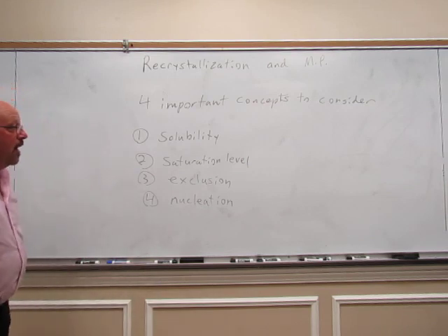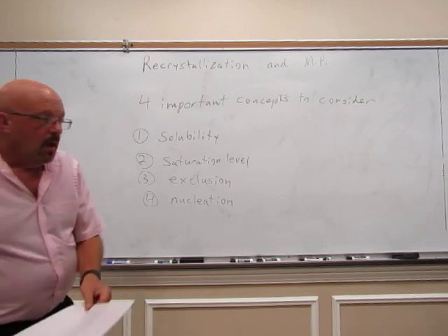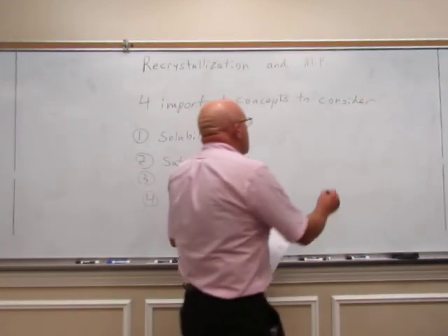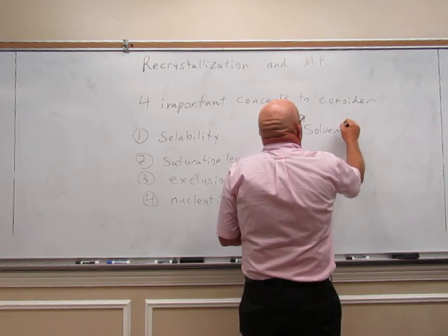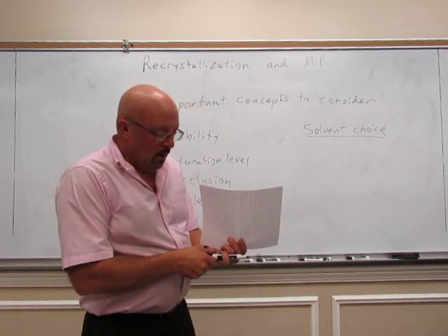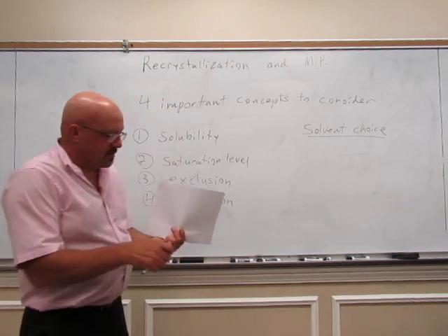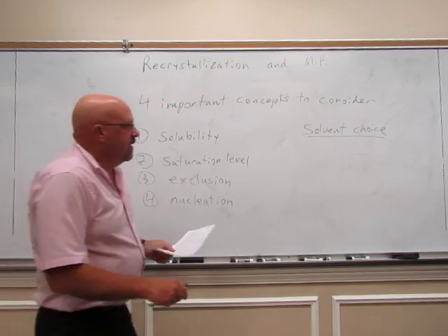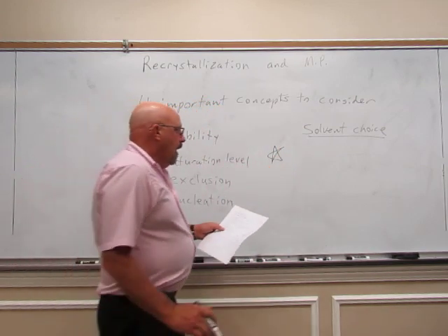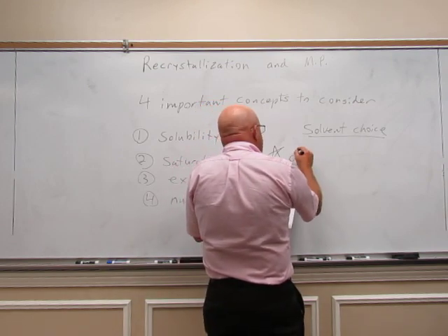So let's first talk about, we'll just go in order here, the solubility. The choice of solvent is very important. The most important concept of solvent choice, I'm going to put a star beside this one. This is the most important. It must dissolve the solute at high temperatures, but not at low temperatures.